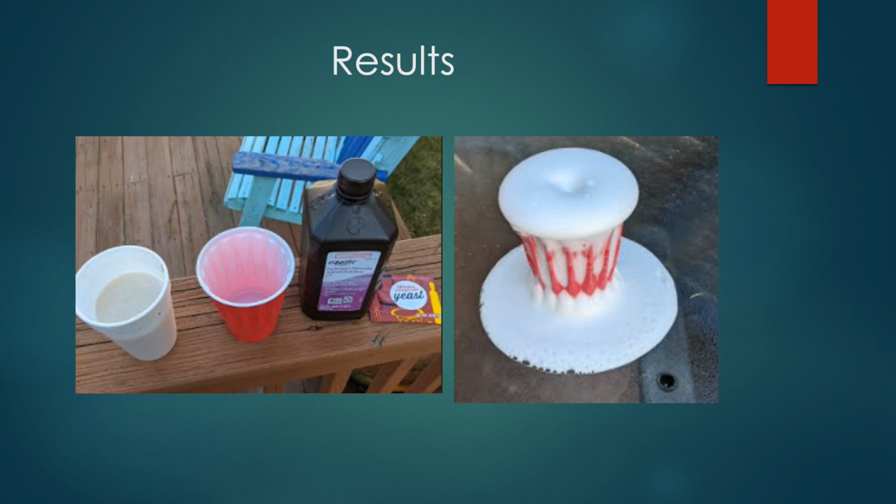Unlike most of my other experiments, this one turned out to be a success. I now understand and agree that this is a good reaction to show beginners or to entice wonder in someone that may not know much about chemistry or about what they may want to study. Just seeing a reaction like this makes me wonder what is going on for this to happen. And with this project, I was able to find out exactly why.